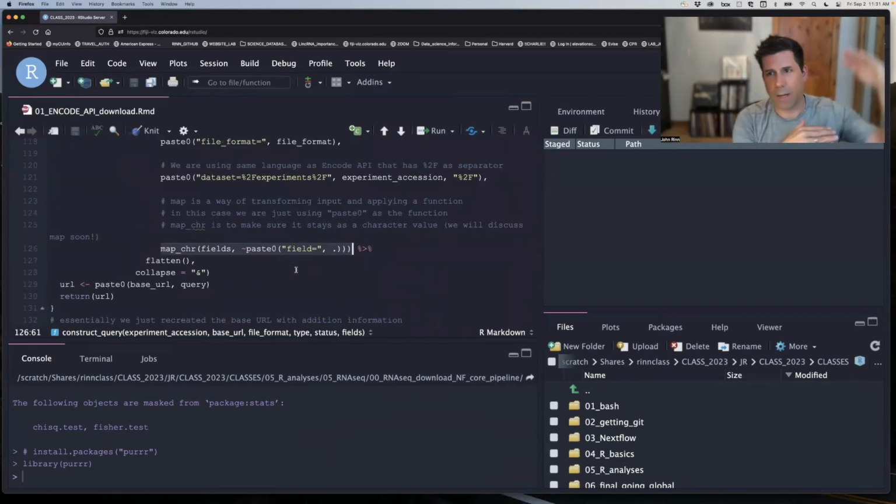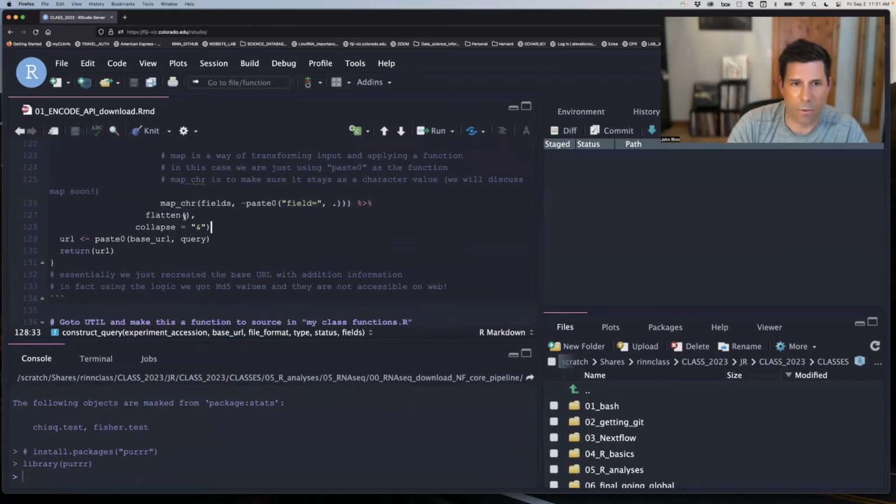So we're going to basically take a bunch of file information and paste all 4 values in one slot. We're going to look at that more because we're going to have to do that as we move forward in our analyses, compressing the information for things into one row, so to speak. It's really cool, and we'll go over that in detail in the next class.